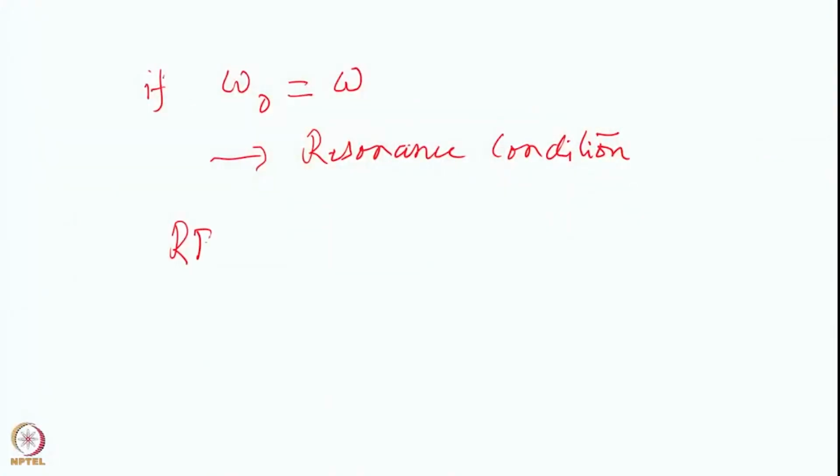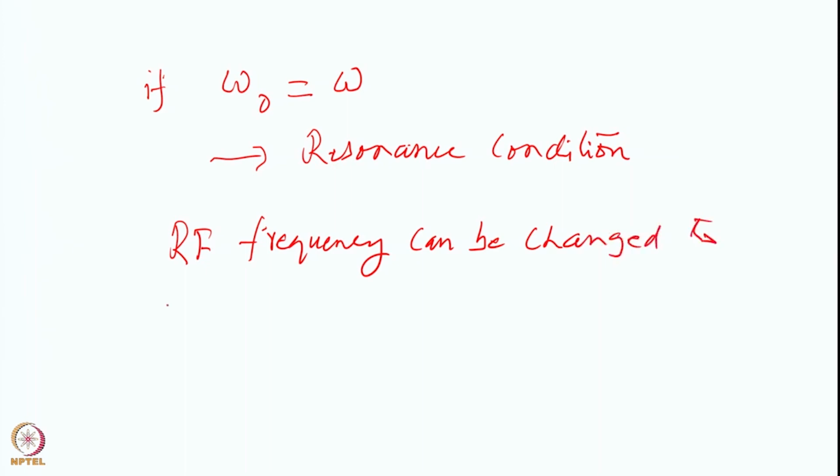So, therefore, you have the RF which you can keep changing. RF frequency can be changed to achieve the resonance condition.